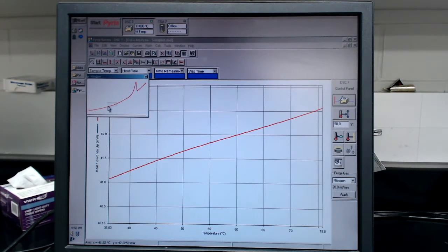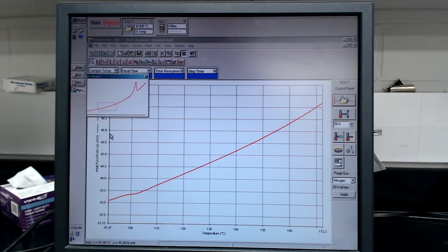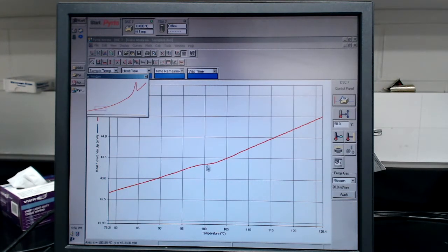Otherwise, if we look at the other area, it's hard to see without having to zoom, but if you zoom in, you can also notice a little inflection in the curve, and it looks like it's at around 100 degrees. So right around here. You notice that the curve is relatively smooth, and then there's this little step, and then it is relatively smooth on this side. So there's something happening here. Those are the two things that we'll want to analyze.